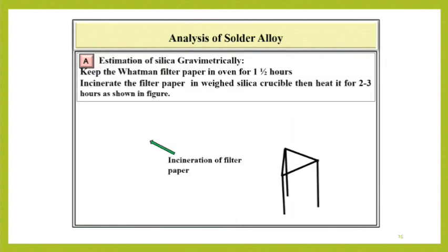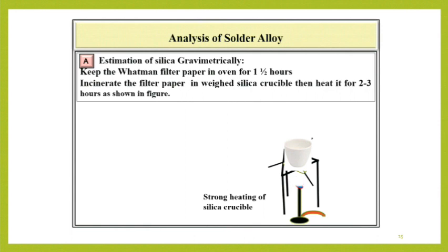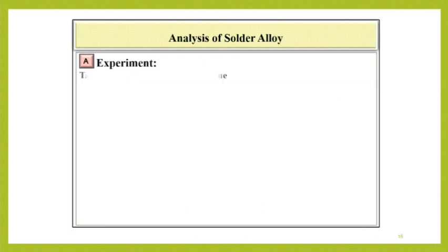For incineration process, take previously weighed crucible, fold the filter paper as shown in the video, fold it with the pair of tongs and heat it strongly by using blue flame. Transfer all this filter paper in a crucible and then heat this crucible strongly on a blue flame for about 2 to 3 hours.